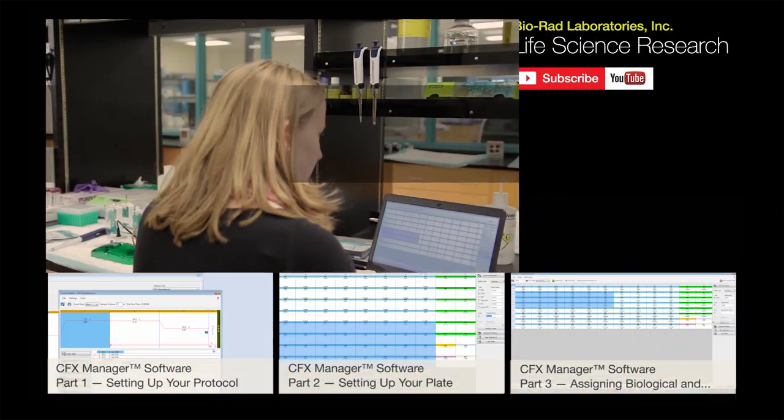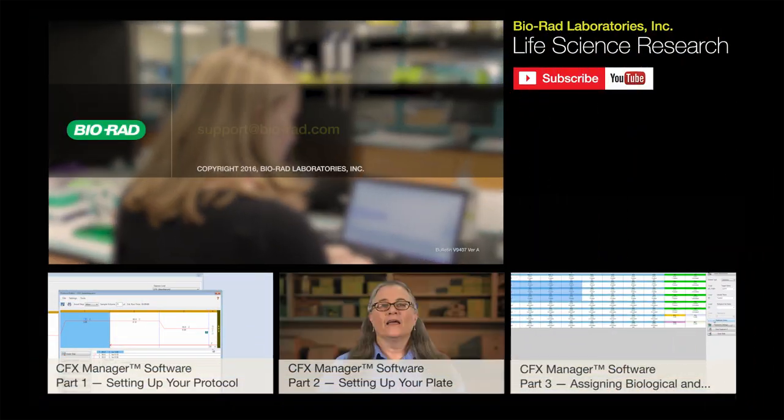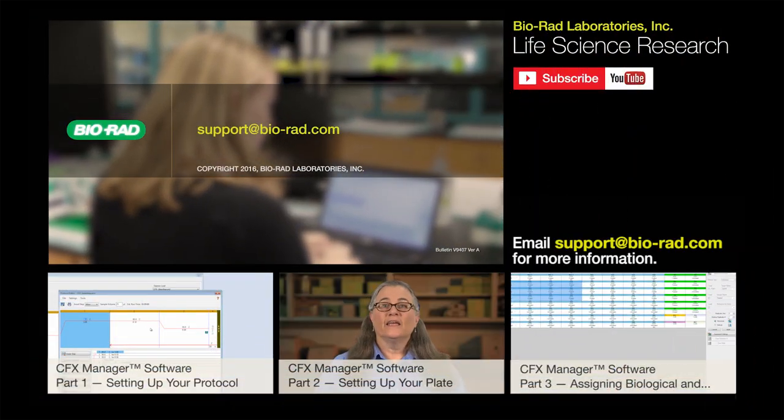You should now be able to better analyze your gene expression data using CFX Manager. We hope this helps, but if at any time you need help with any of your Biorad products, please email us at support at Biorad.com.